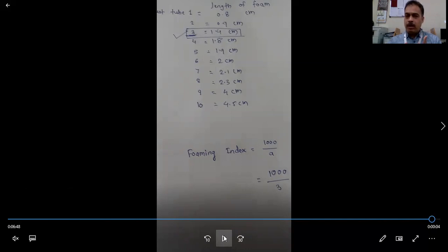If all test tubes have 1 centimeter of foam, then the foaming index is more than 1000. And if all test tubes are showing less than 1 centimeter of foam, then the foaming index is less than 100. But in this case, the first test tube is not showing 1 centimeter, the second test tube is also not showing it, but the third test tube is showing 1.4 centimeters, which is more than 1 centimeter.